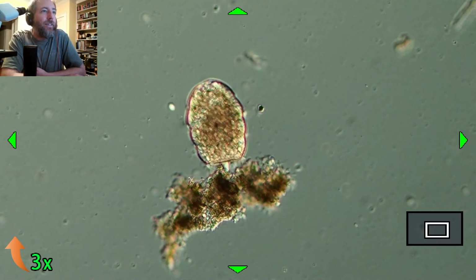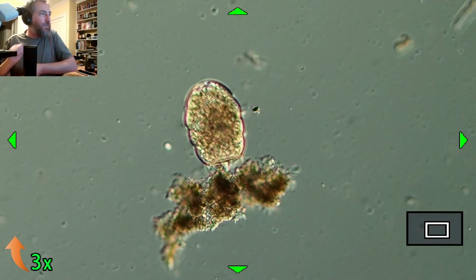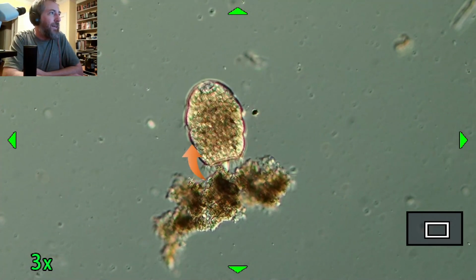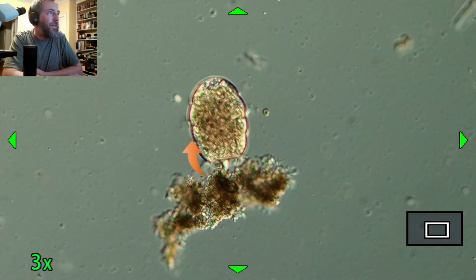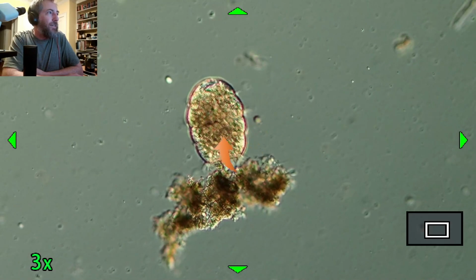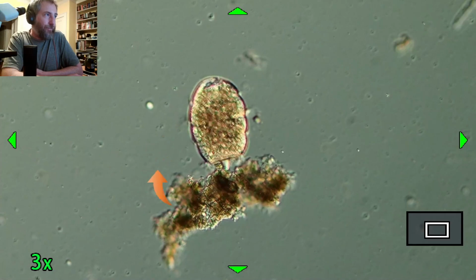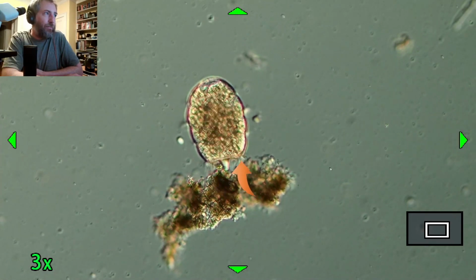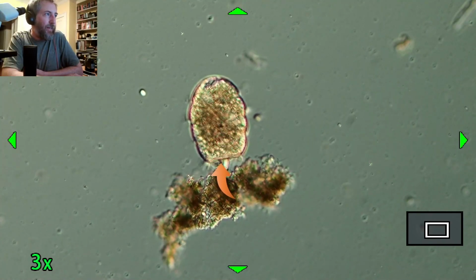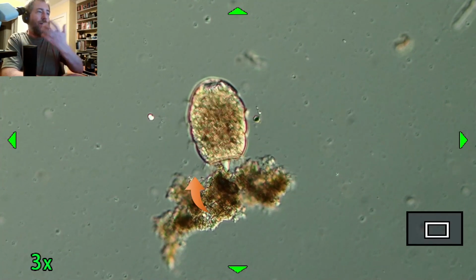Vortex like a tiny galaxy? Yeah, exactly. It's the lampshade. Actually, you can see it has some sort of fringe right here on both sides, and then it has a couple of rows of cilia going around its body. Here's one, here's one, here's one. So like a barrel with a couple of rings of cilia. And then there's a big fringe around its actual mouth, which is here somewhere. And then it's got something coming out. We saw this when it was kind of looking at it end on as well.